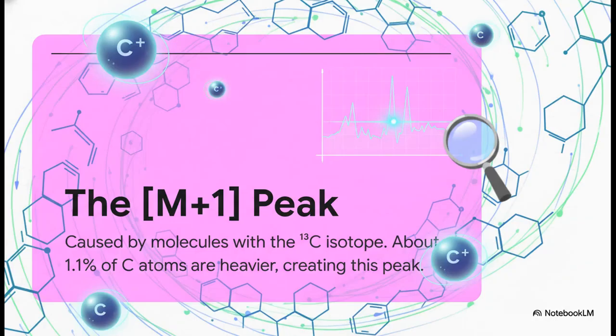It's another isotope, but this time it's carbon-13. You see, while most carbon in the universe is carbon-12, about 1.1% of it is the slightly heavier carbon-13 isotope. This means that in any sample, a few of your molecules will naturally contain a carbon-13 atom, making them one mass unit heavier. How cool is that? It just shows you how incredibly sensitive these machines are.